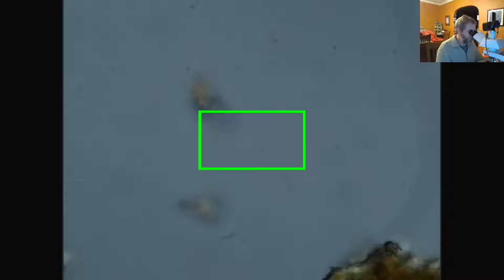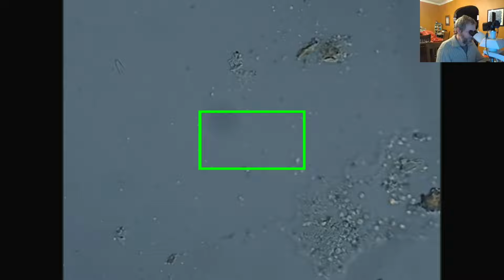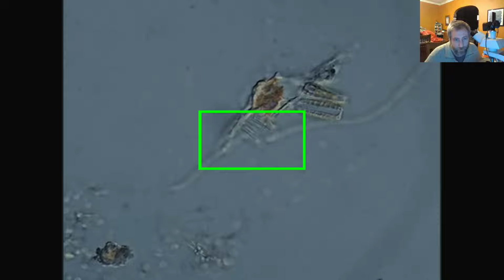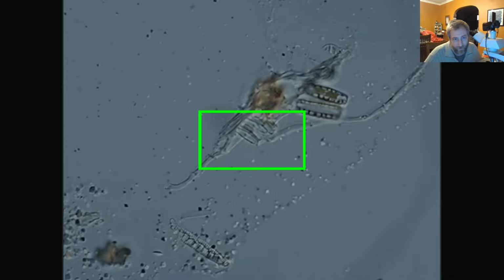This is a Cymbella that we saw earlier in the stream. Cymbellas are benthic diatoms. They don't actually tell me anything about water flowing or anything like that. You can see here's some little tiny Achnanthidium, a really tiny little Achnanthidium attached to something, and also you can see those Gomphonema attached, all attached to some little mass, and that's because the sample wasn't digested, and so I still have some organic matter present in them.